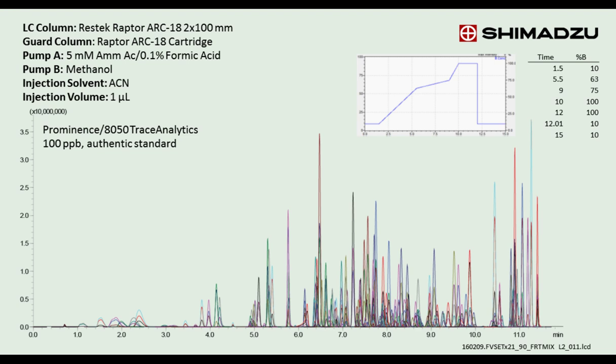So our sample is injected onto an LC column, and our separation is performed, and the pesticides will elute with an expected retention time. An example chromatogram is shown in this figure. For each analyte, we detect its presence by using the machine settings in MRM mode, and we've optimized the MRMs for each analyte to get the maximum signal. We've also adjusted the chromatography to give us good separation between the interfering components and the analytes of interest.